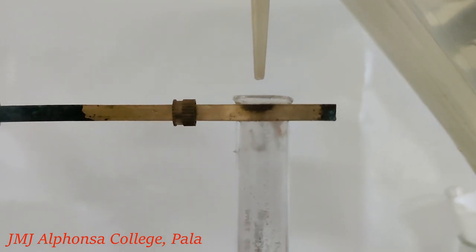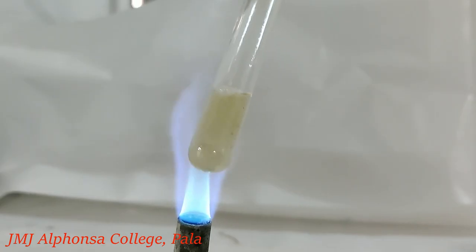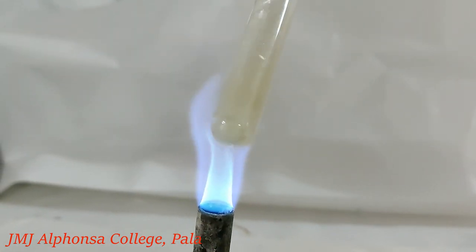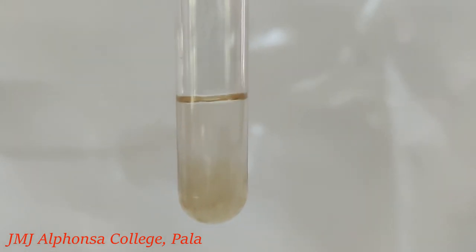Cool it and add a few ml of distilled water. Boil it to one-third of its volume. Filter it. Sodium fusion extract is ready now.